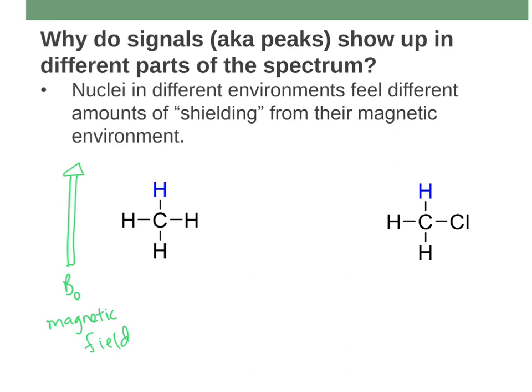And the nucleus here, this little blue dot is supposed to be the nucleus. We know that protons are positive, so it's just a little positive thing right here in this hydrogen atom, and then it's surrounded by electrons. I'm just going to draw an electron cloud around it that's pretty even. That's a nonpolar bond, a CH bond is nonpolar. So it's surrounded by electrons.